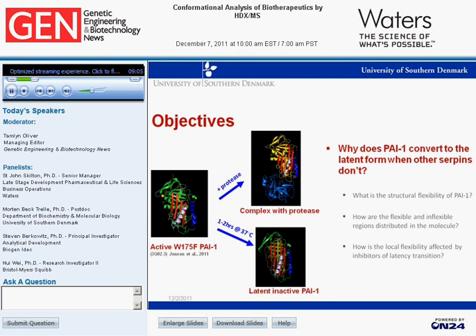In order to get closer to an answer to this question, we think it's important to investigate the structural flexibility of PAI-1, and we have used hydrogen deuterium exchange to do so. In this presentation, I will show you some studies on hydrogen deuterium exchange on PAI-1 without any ligand bound, but also with these RNA aptamers, which are actually inhibitors of the latency transition.